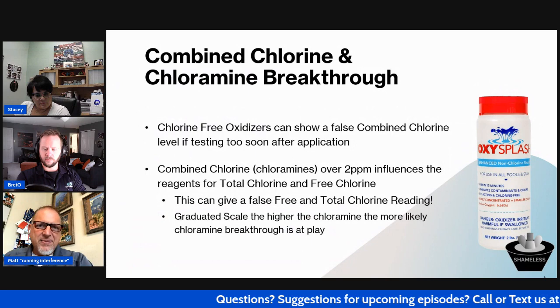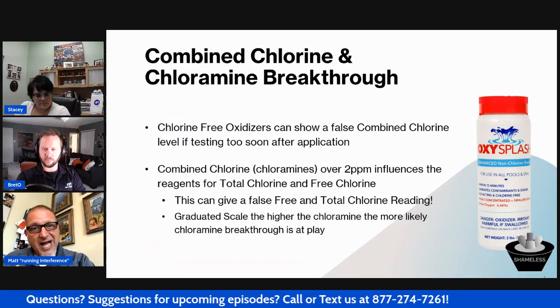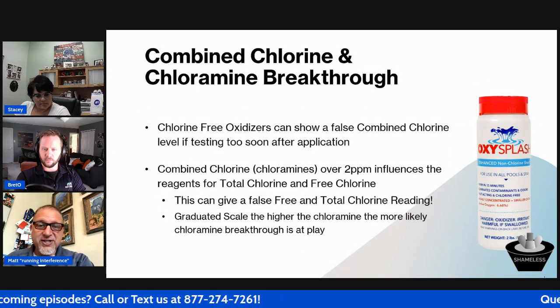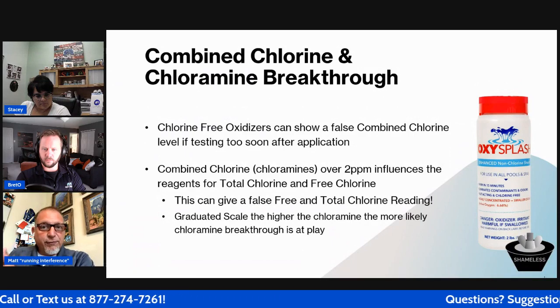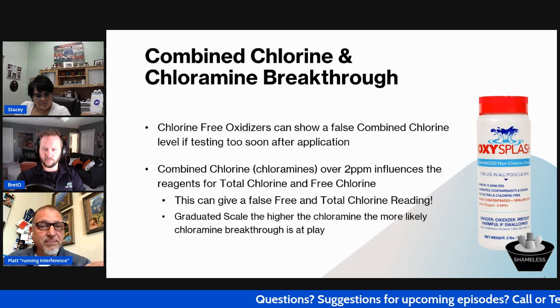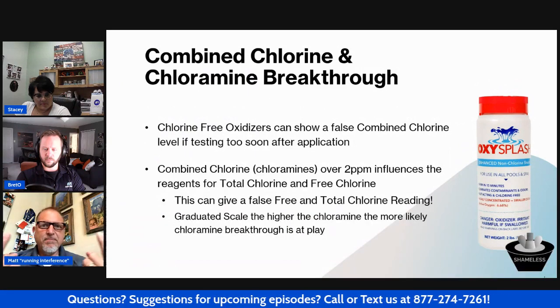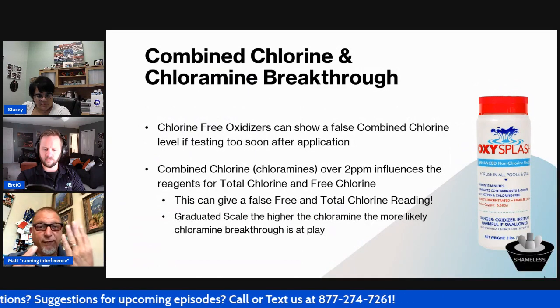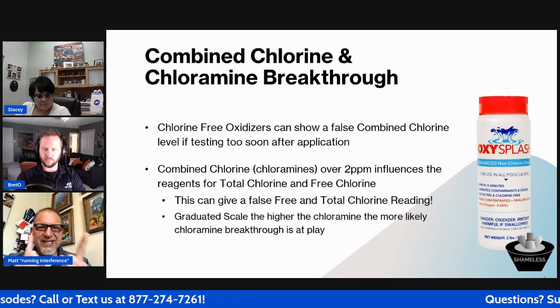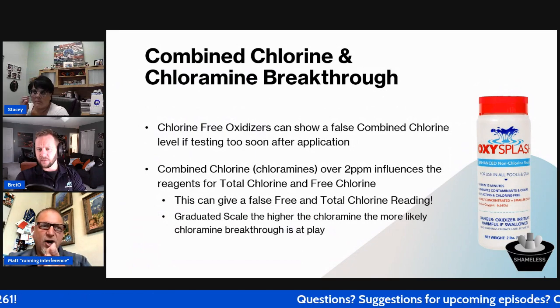So there may be a time when you can smell chlorine in the water, or maybe people's eyes are hurting, or their skin is itchy and things like that, and you do a water sample and you have a free chlorine of 5 and a total chlorine of 5, but in reality the free chlorine is 1 and the total chlorine is 5. The combined chlorine, since it's 4, which is above 2, actually makes the reagents read differently, and when they read differently, they come together and are the same color.